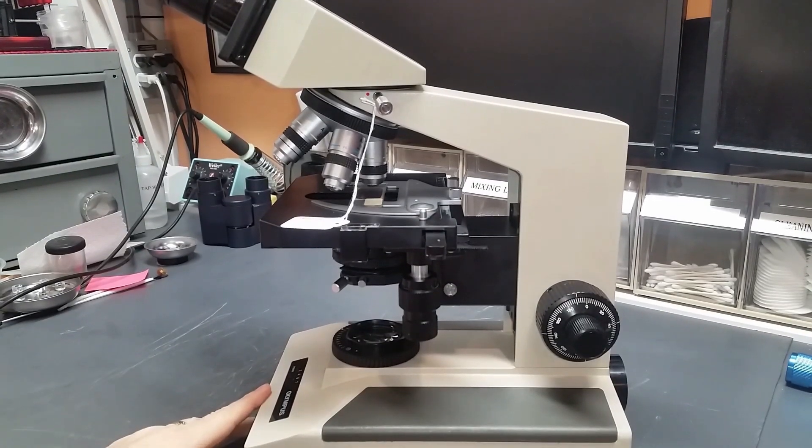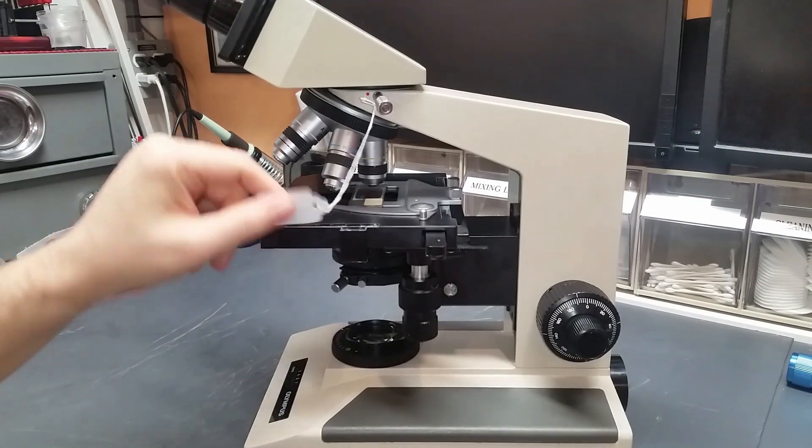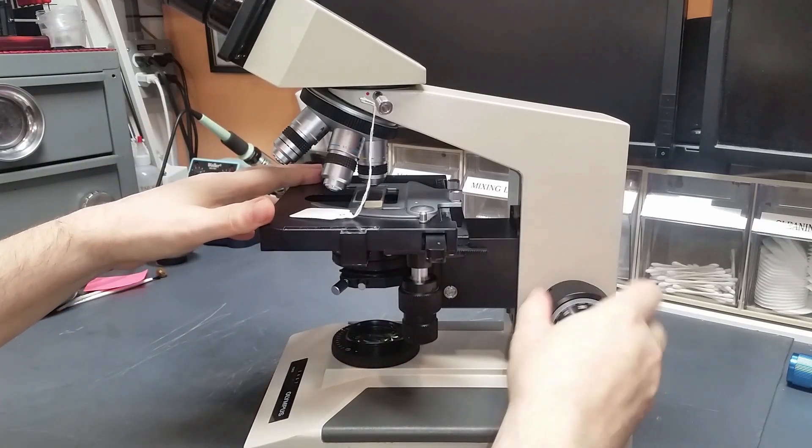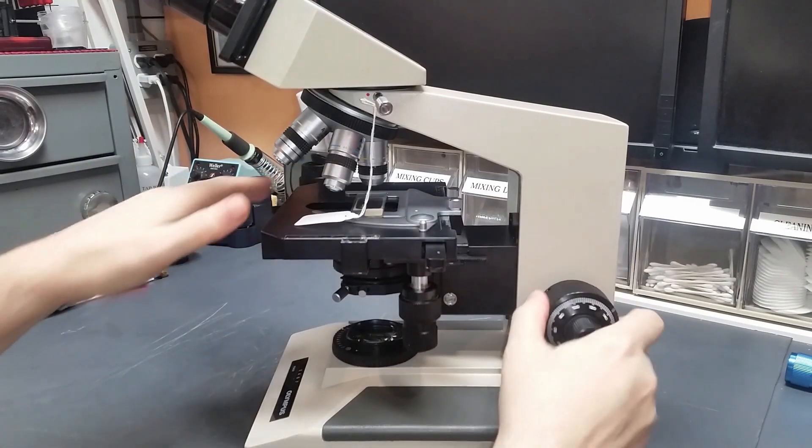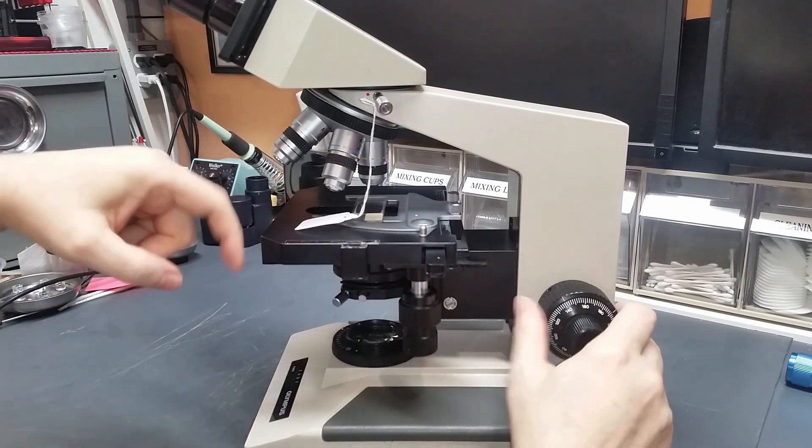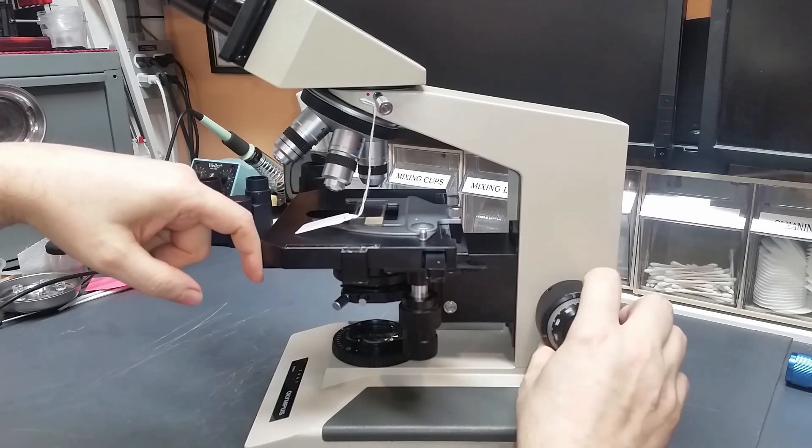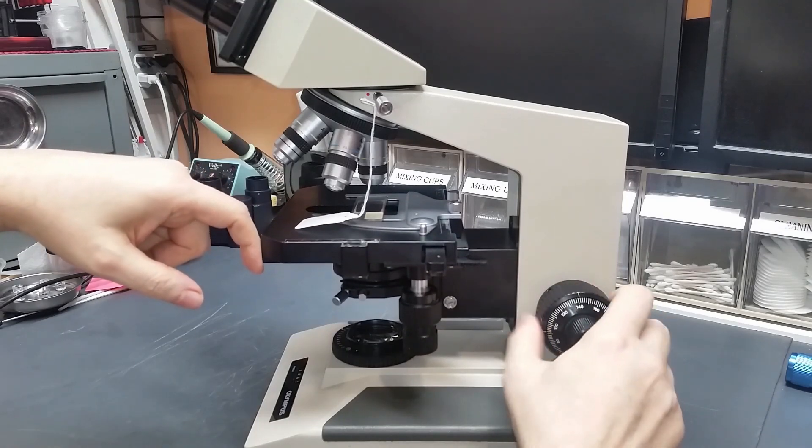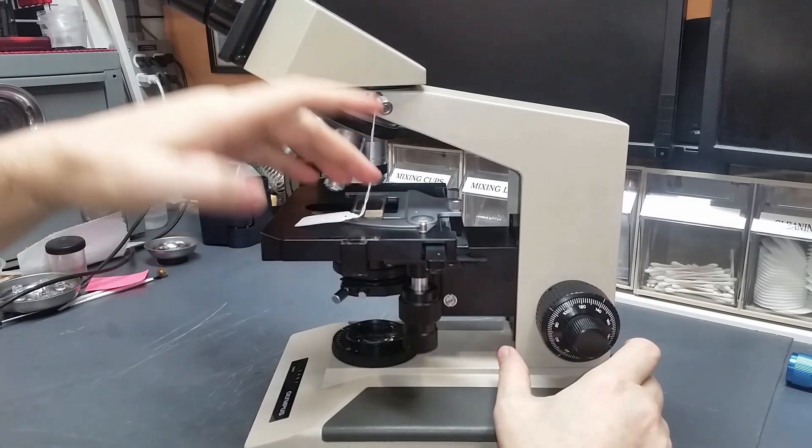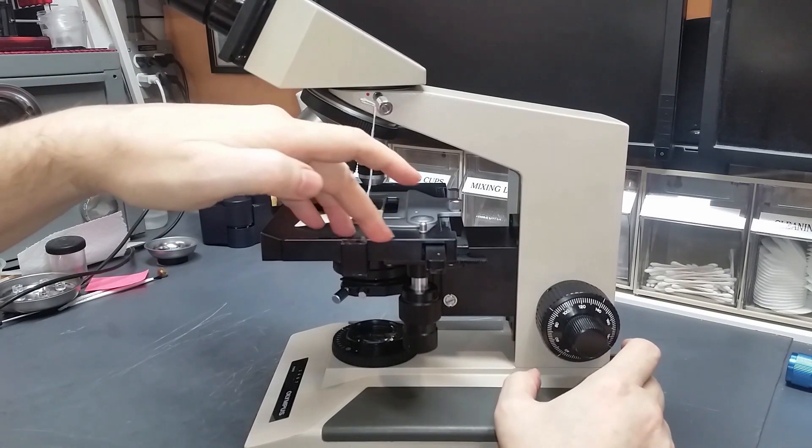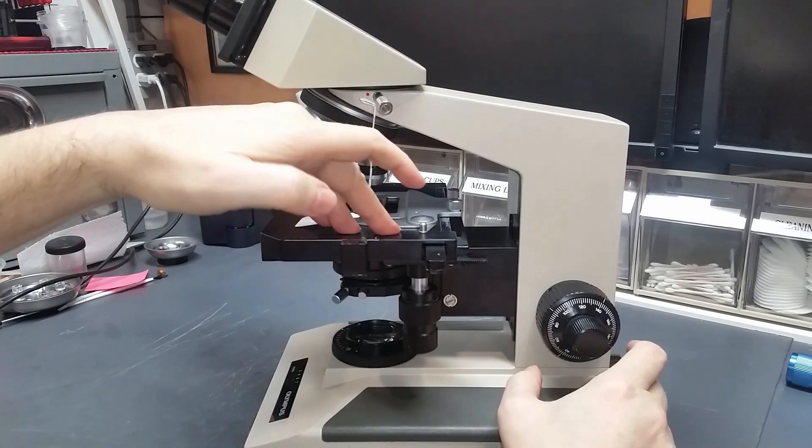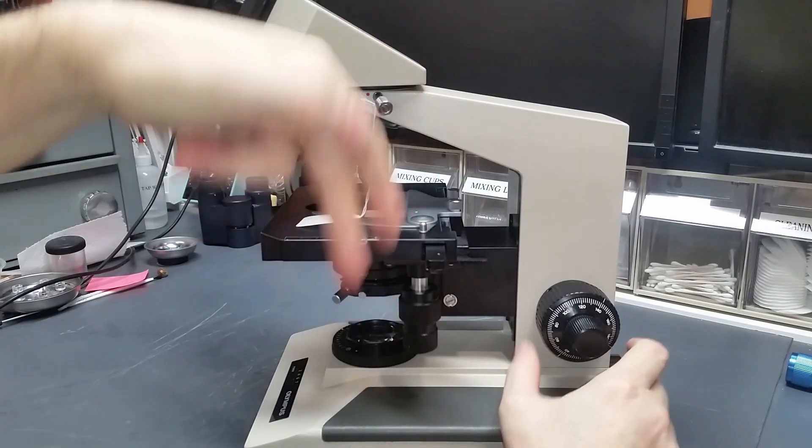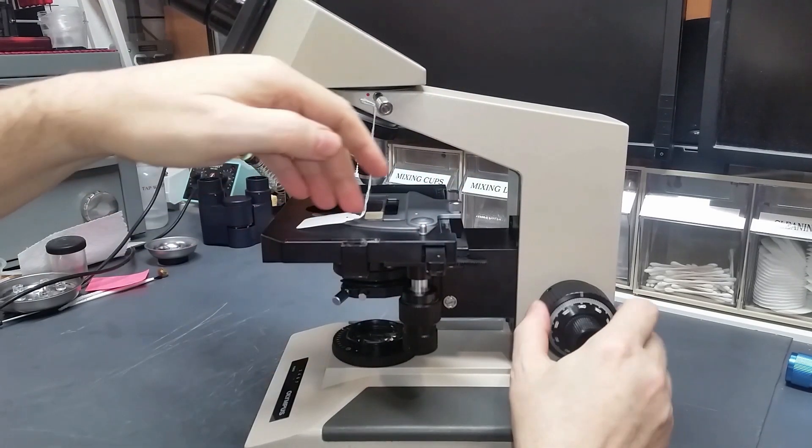Number one is the stage tension. The stage goes up and down as you adjust the focusing on this. And it needs to be set up so that the effects of gravity working on the stage don't cause the knob to spin.